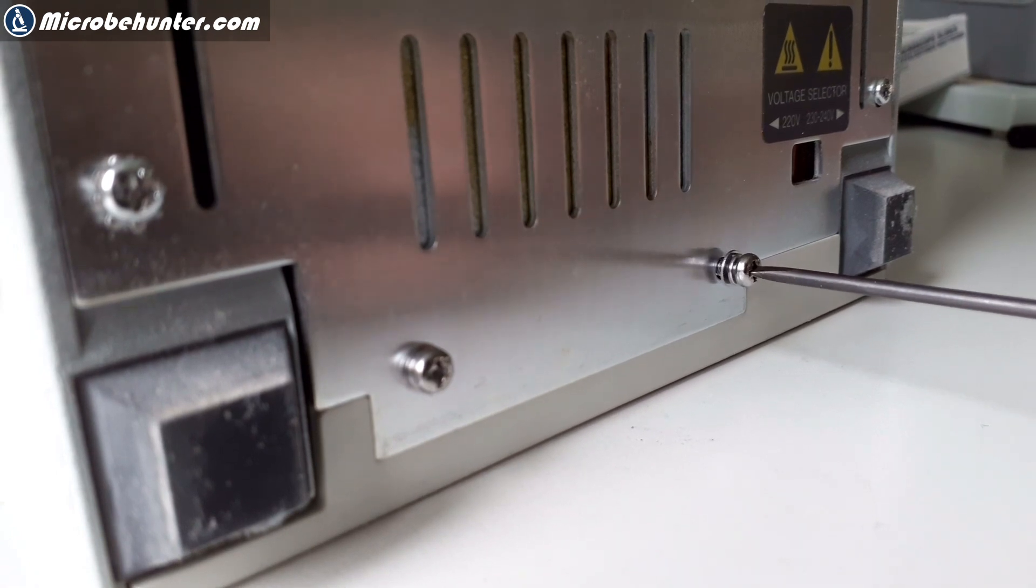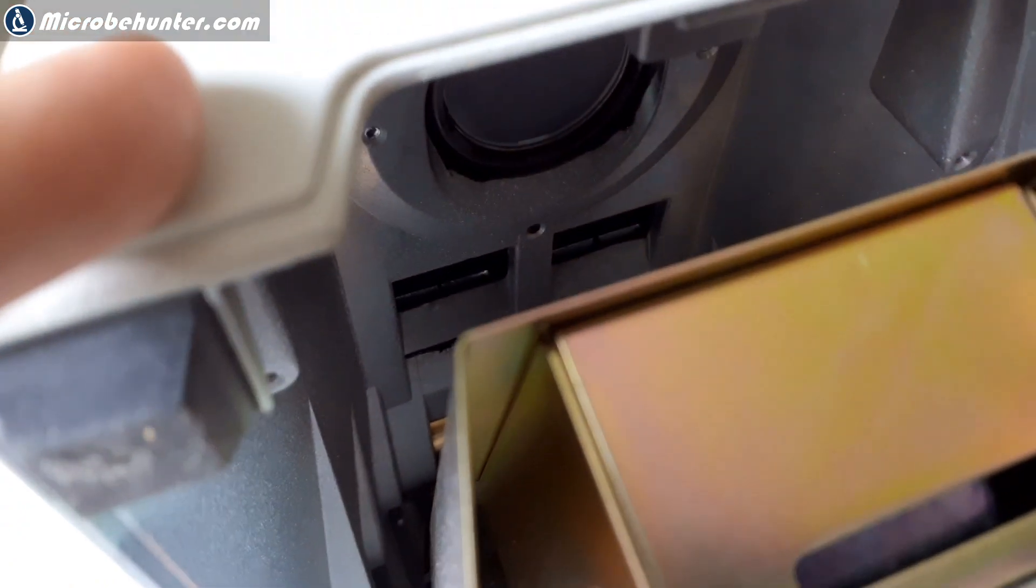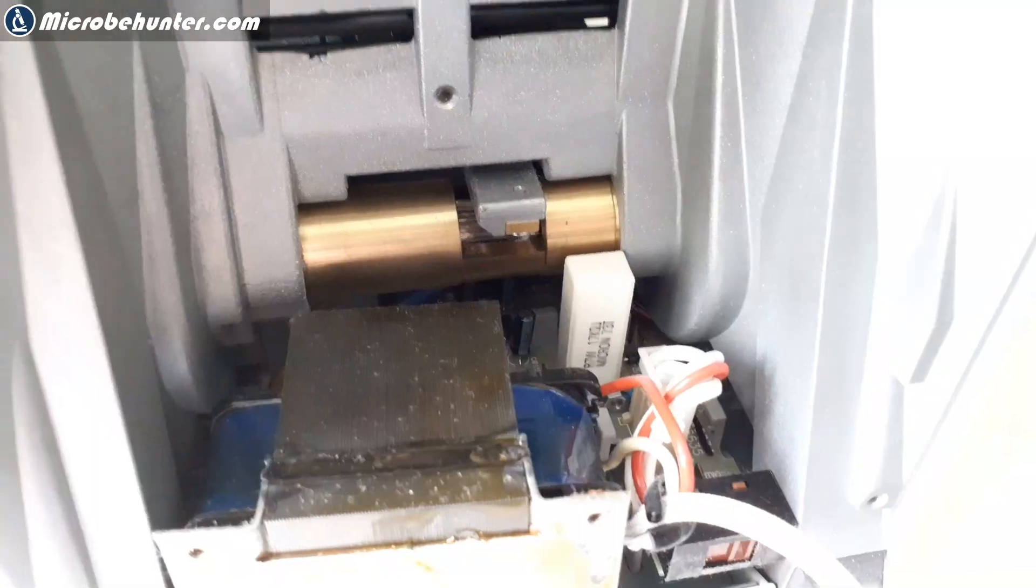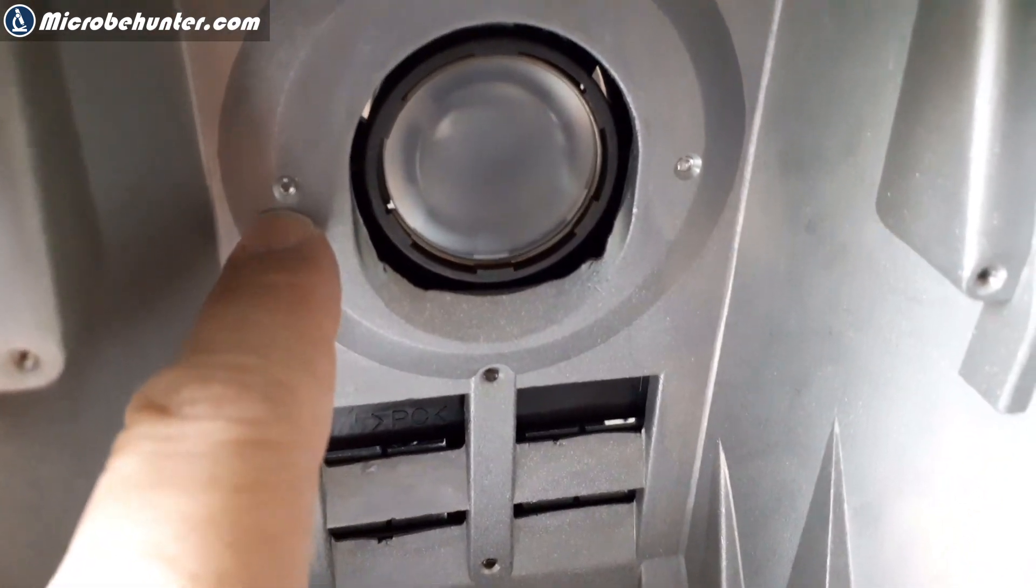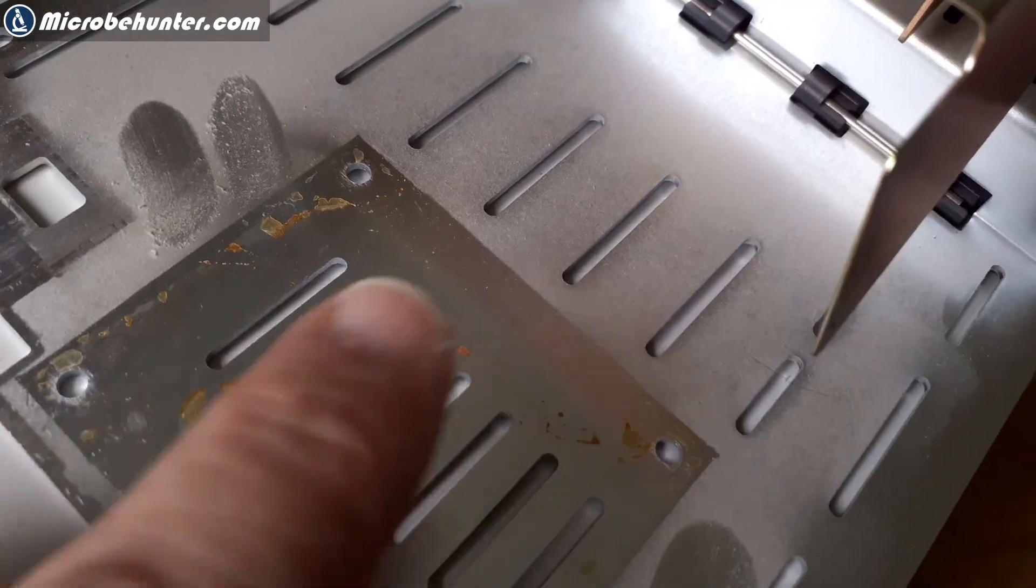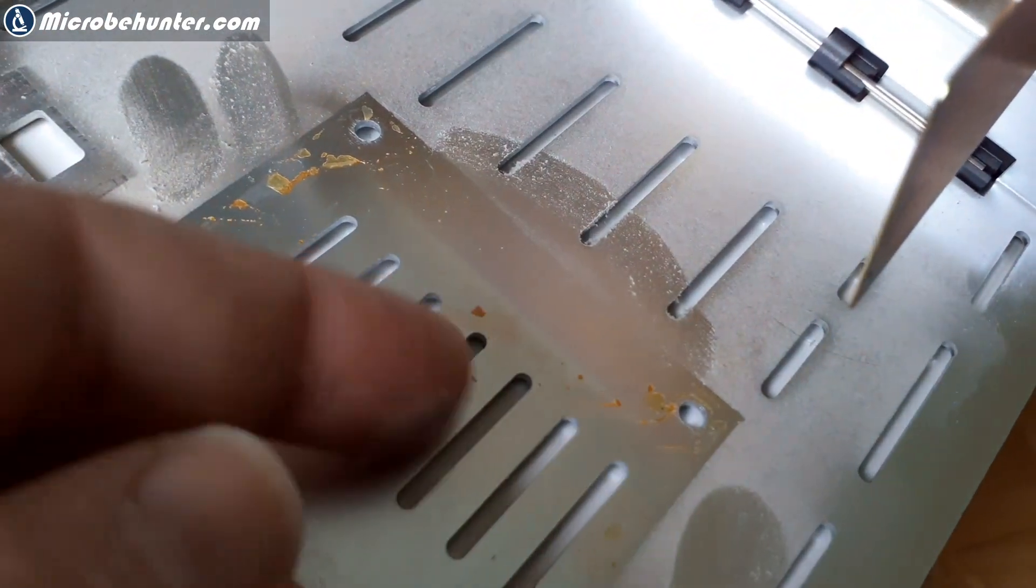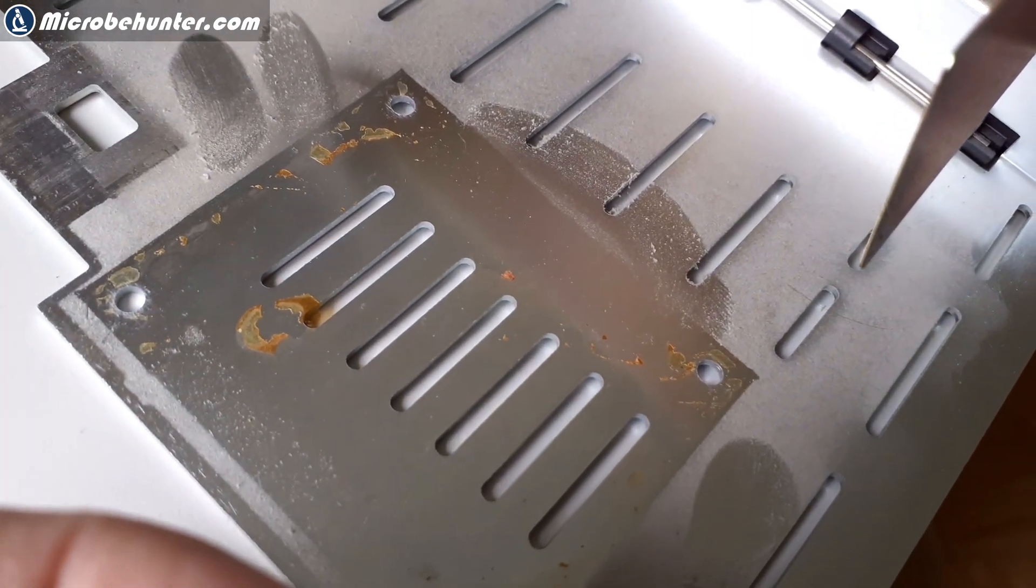So I also flipped the microscope over and took out the bottom part to see if this is actually a better place to reach the illumination system where I supposed the dirt to be. As a matter of fact, here, this is part of the Köhler illumination. Look how much dust and dirt there is all accumulated over the 20 years. So I cleaned all of this away.